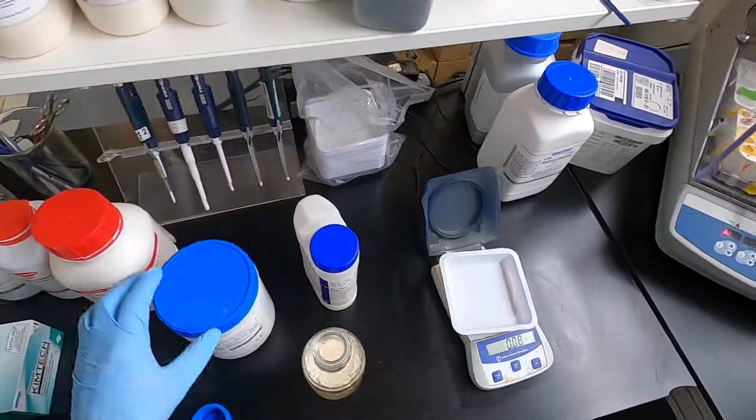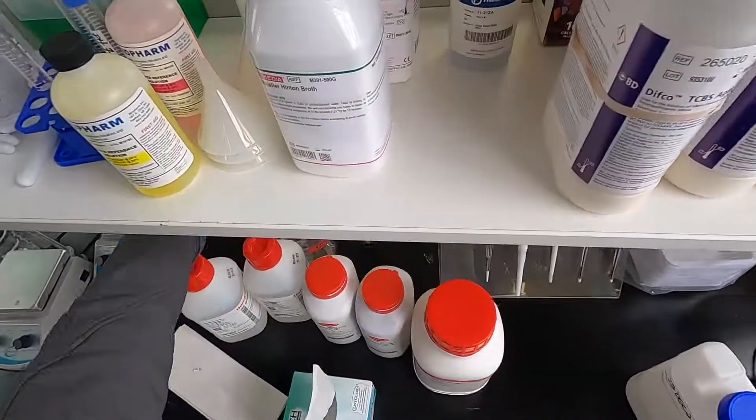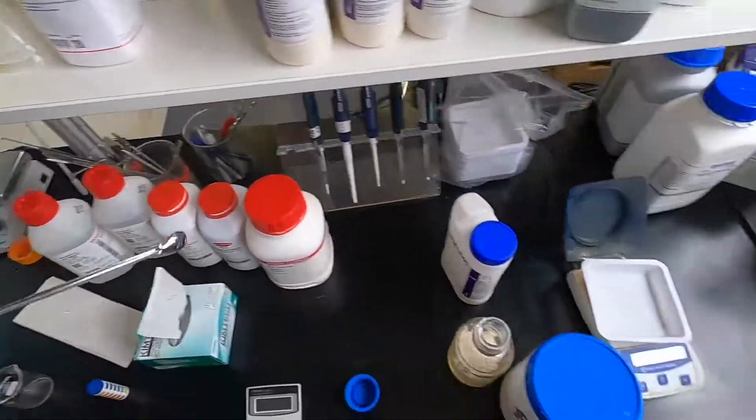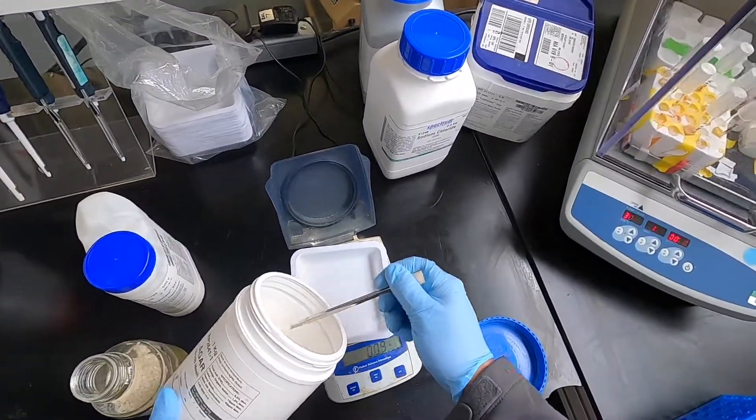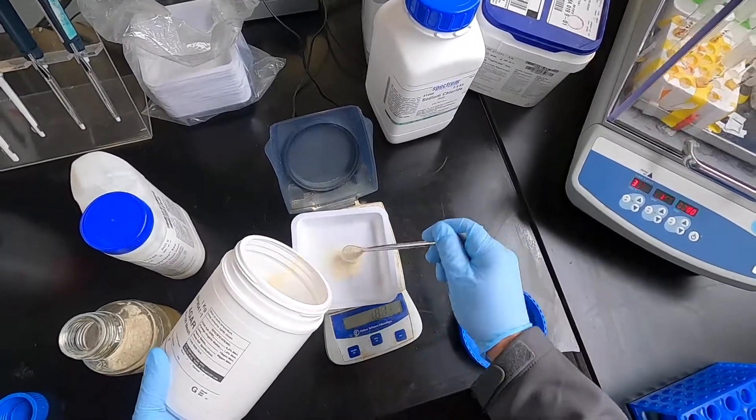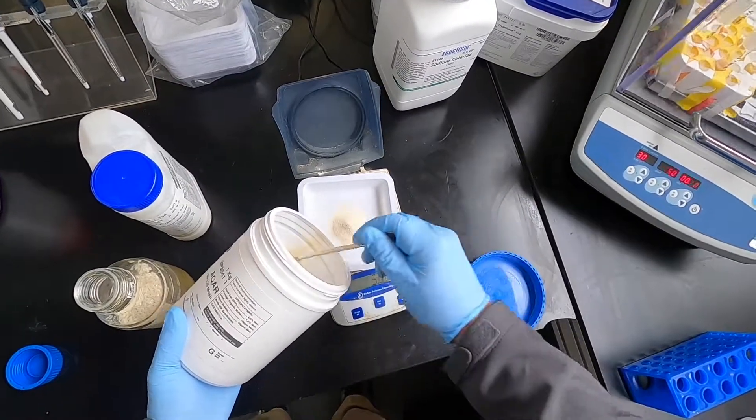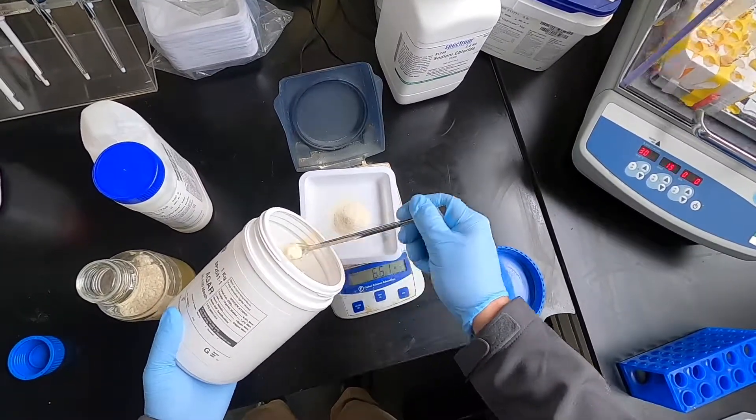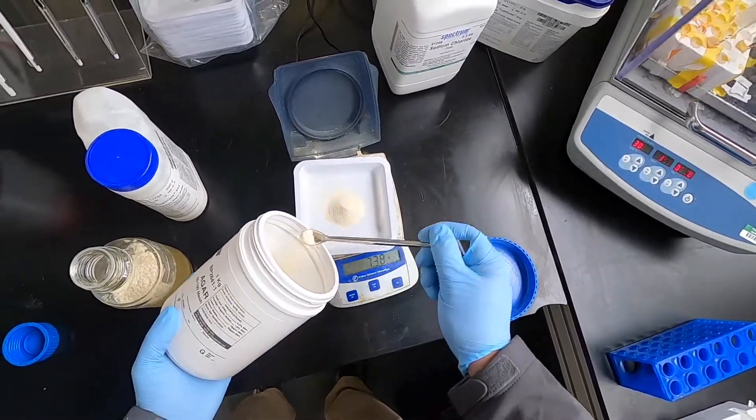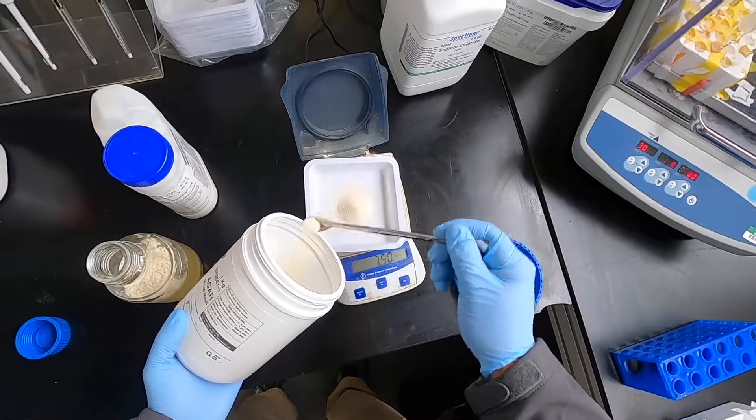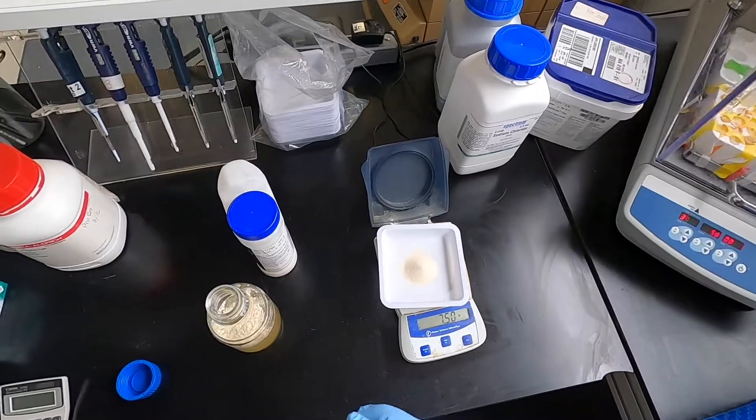For agar, it's 1.5 percent in normal agar, which is 15 grams per liter, so we use seven and a half grams for half a liter. Right on the dot, baby. Professional.